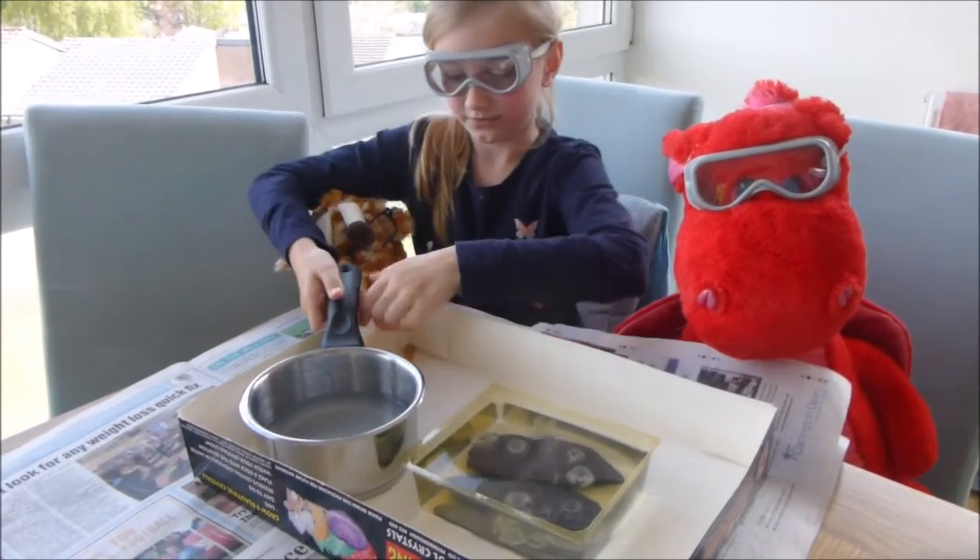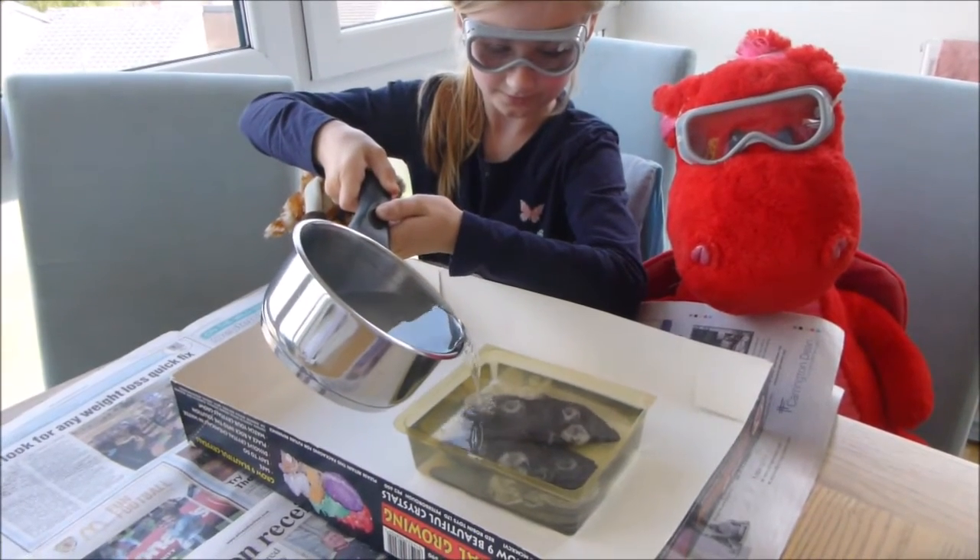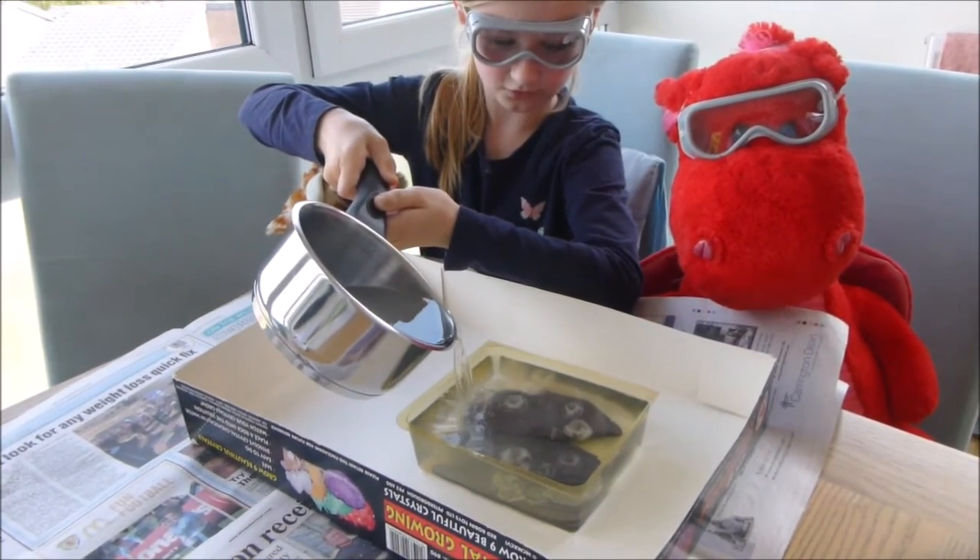So I'm gonna top it up a little bit now — I hope I don't spill it — just top it up to the very top.